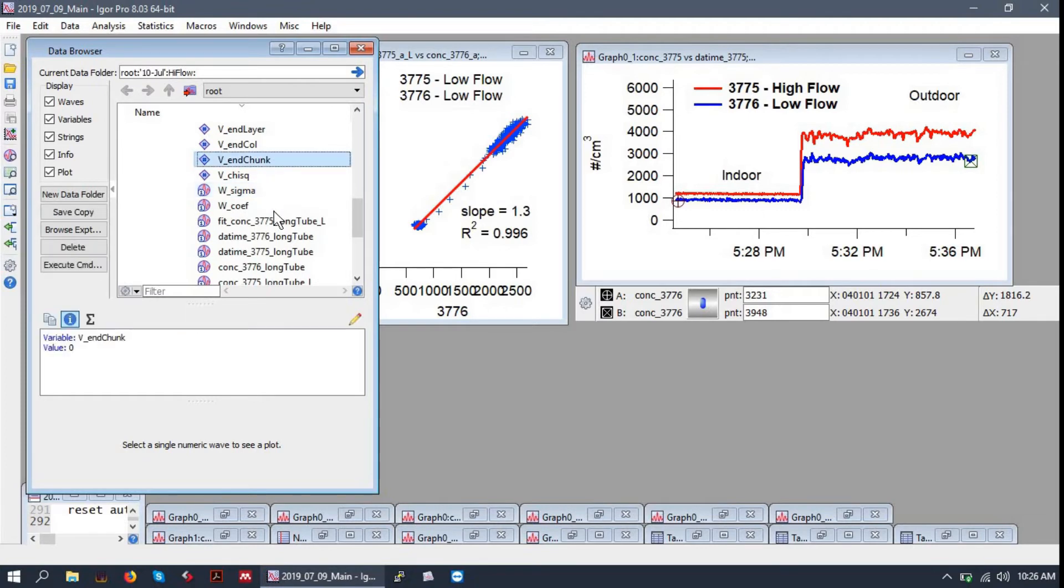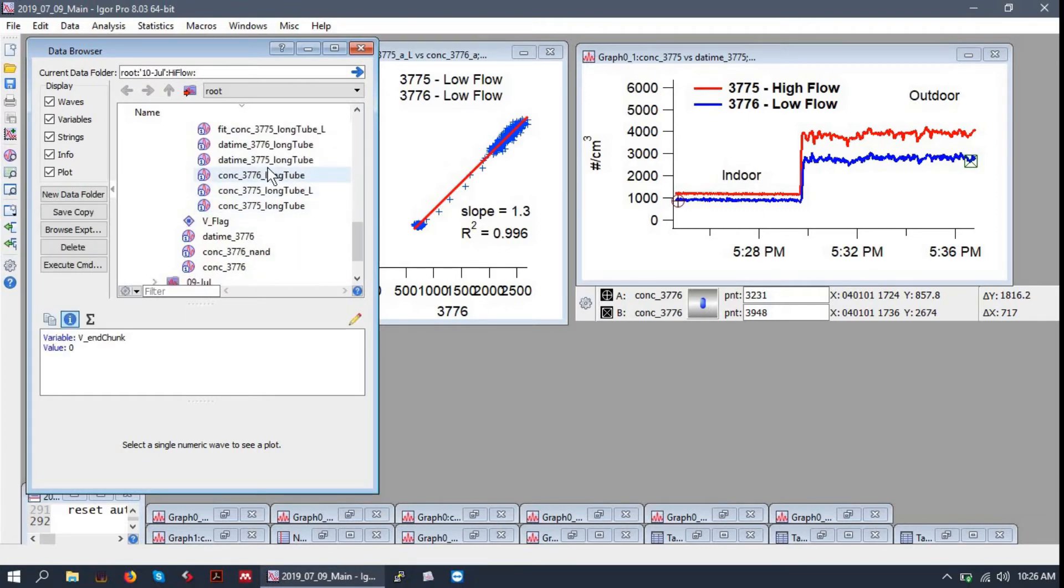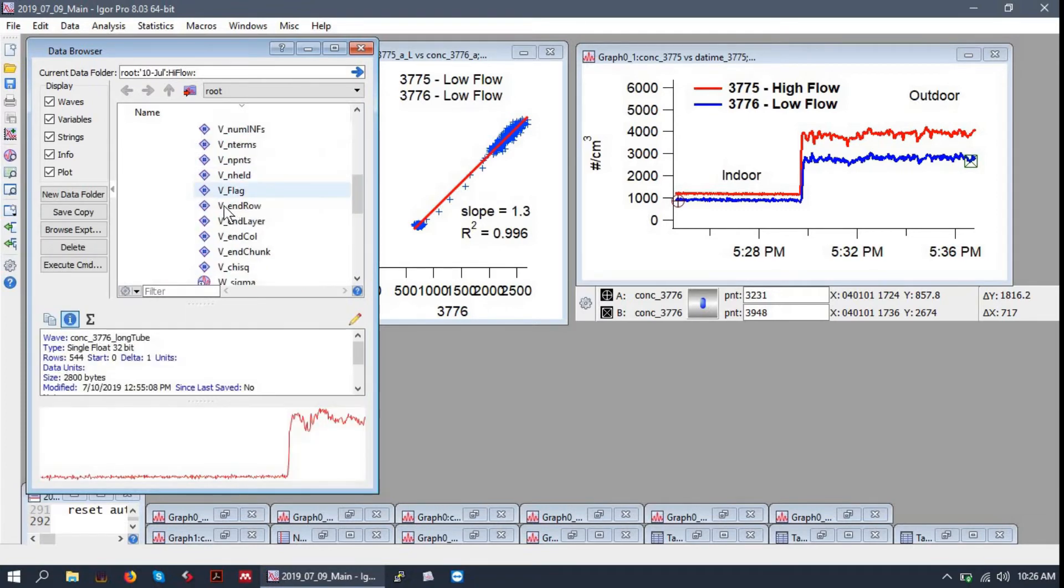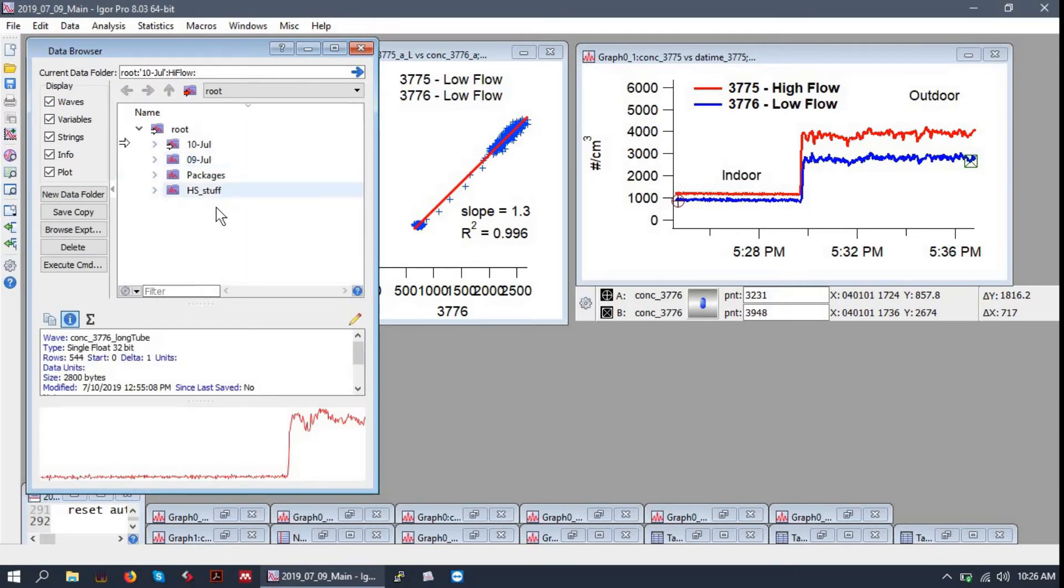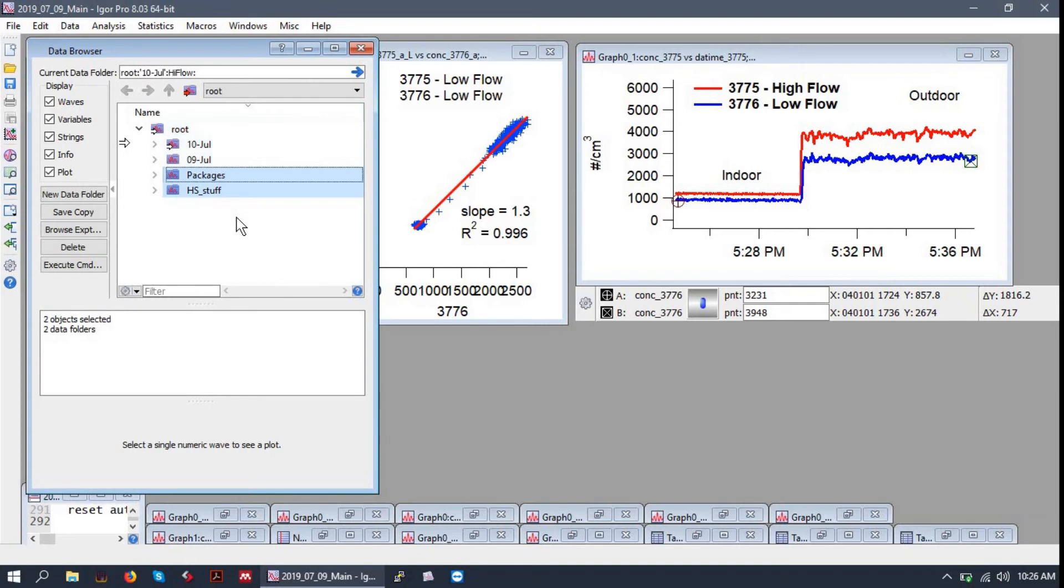So you can see I have some variables, waves, folders, subfolders, and you can keep things very organized in the data browser, so you should strive to.